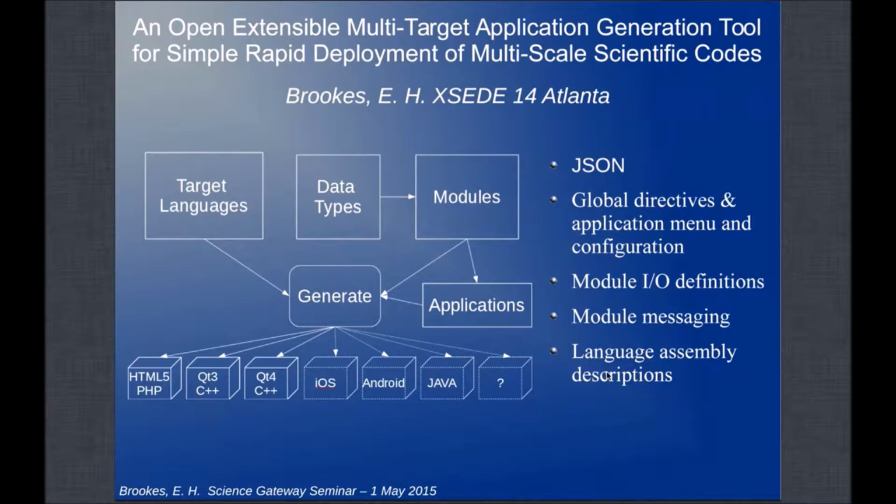From the data that you can get from one of these data sets, you can determine things like size and shape, and you can determine potential structures and do rigid body modeling. Let's say you have a bunch of atomic structures and you can move them about and compare them with the small angle scattering data.